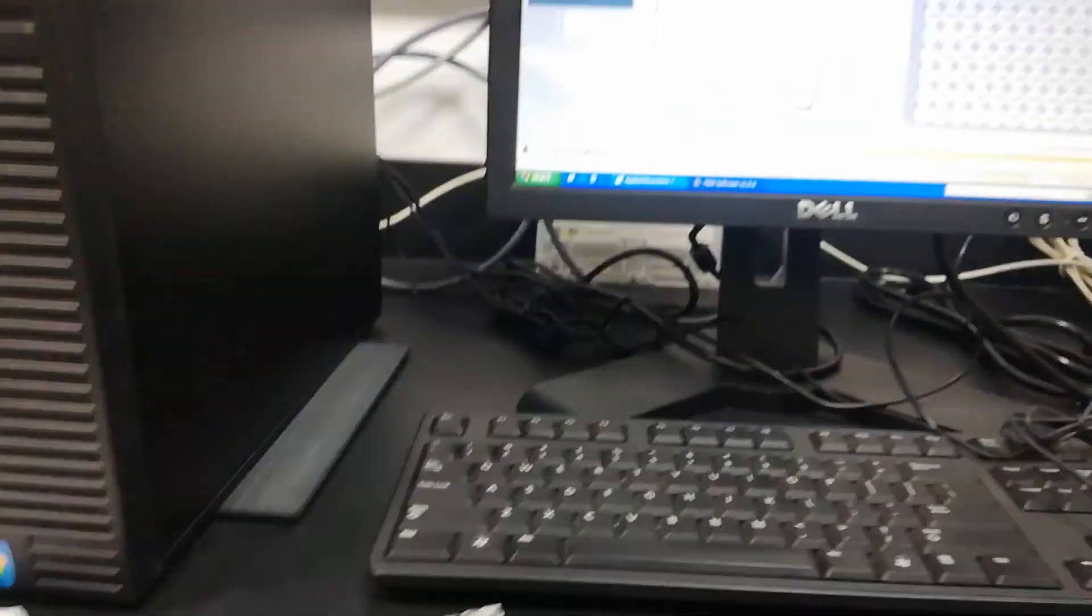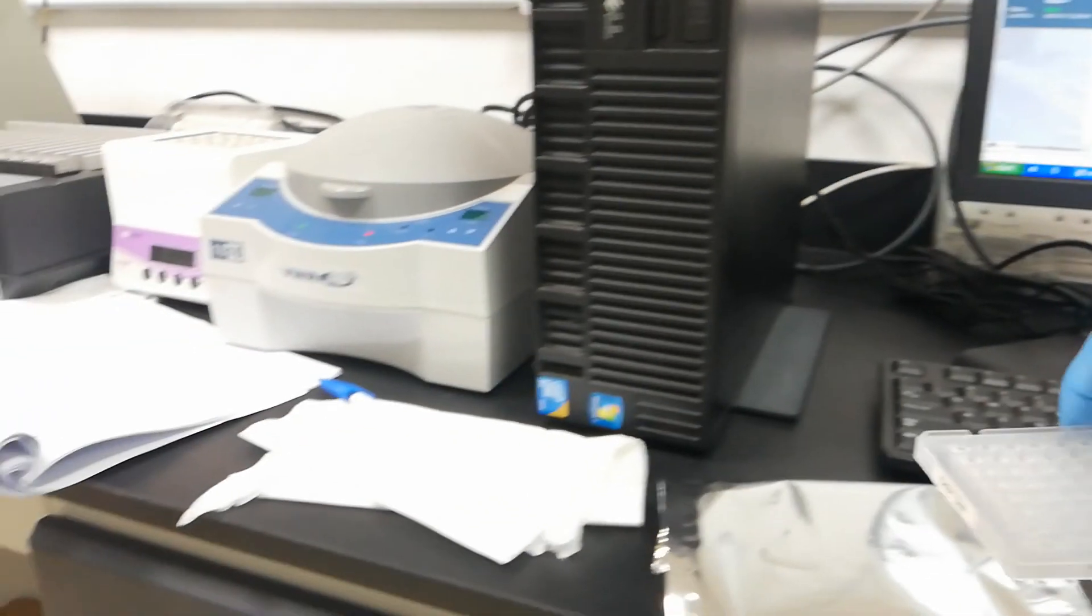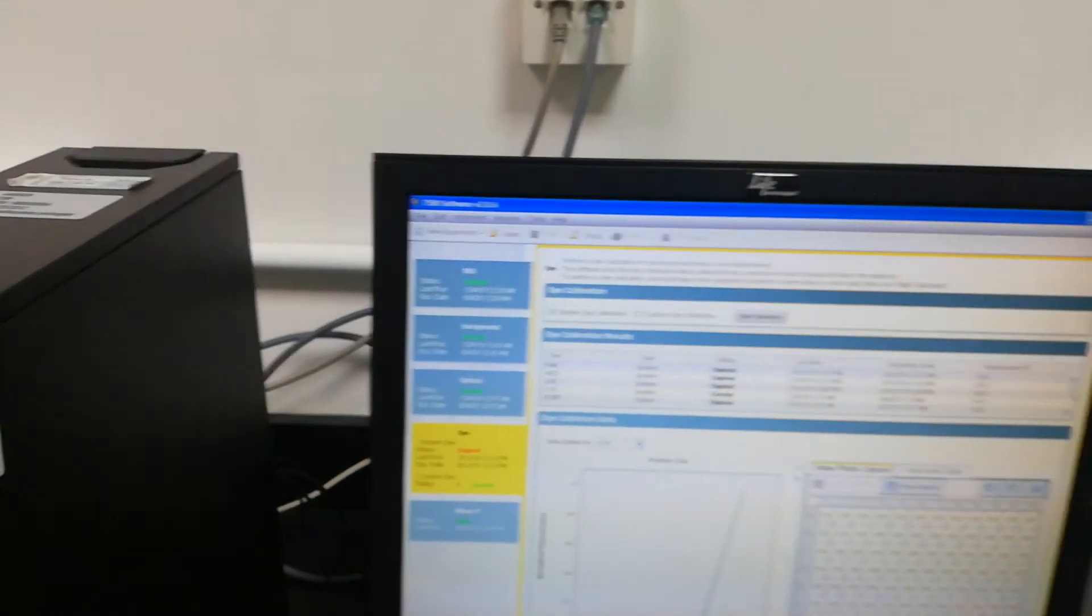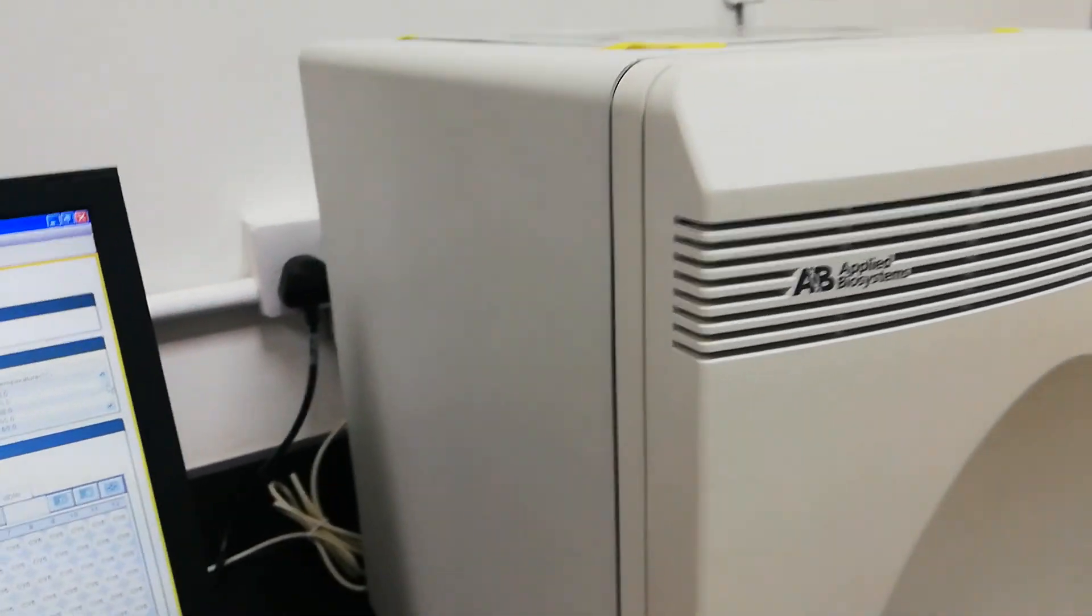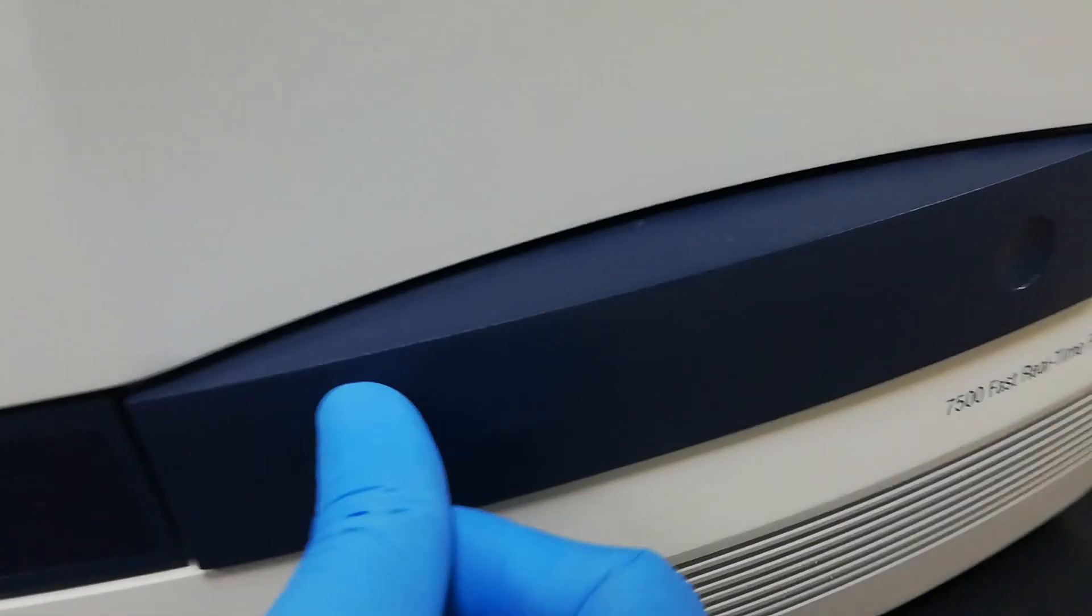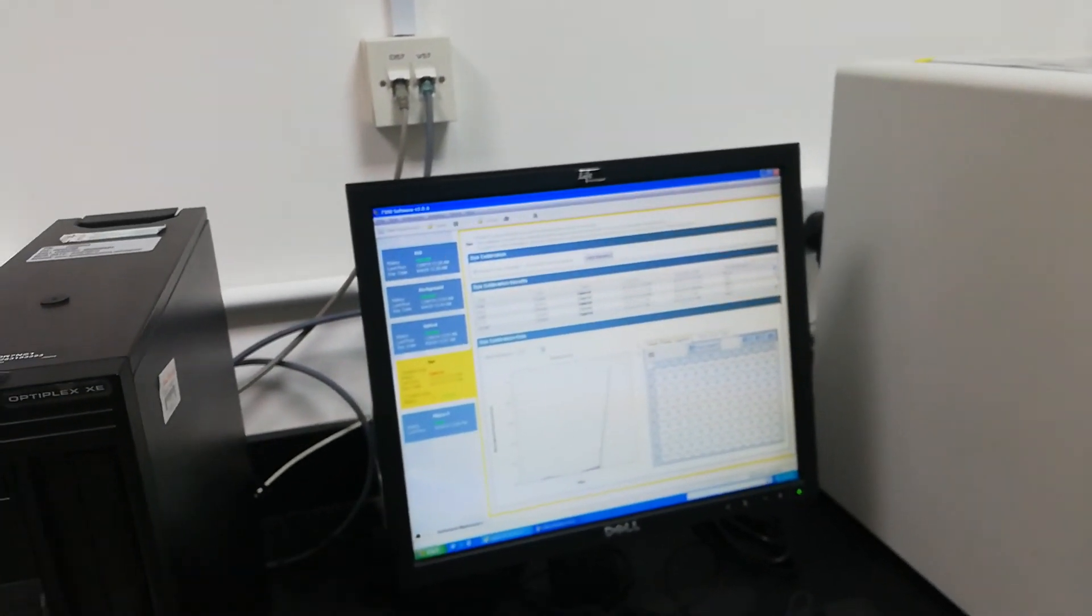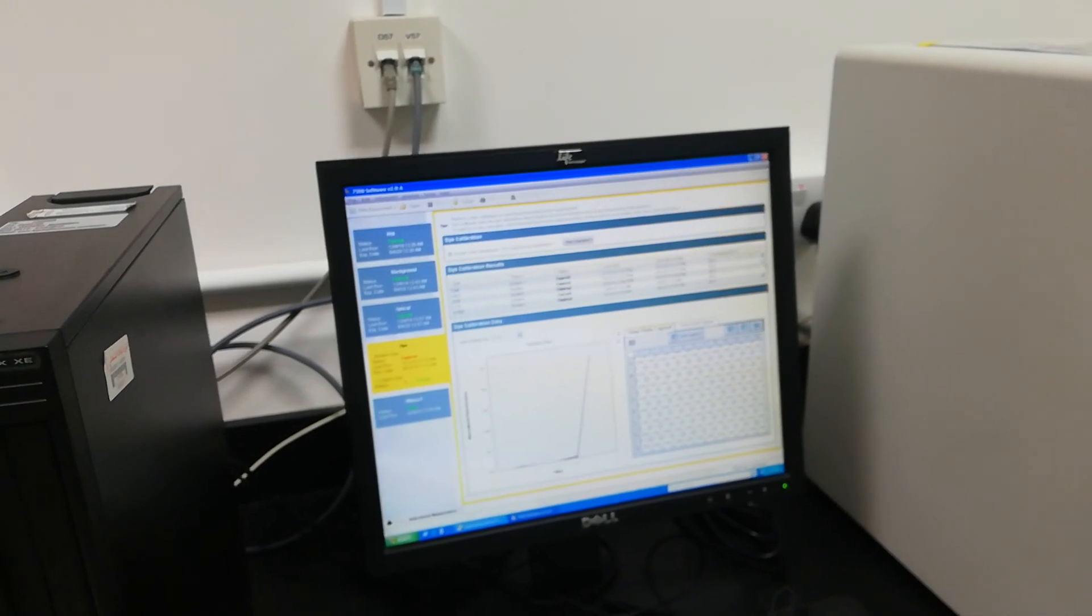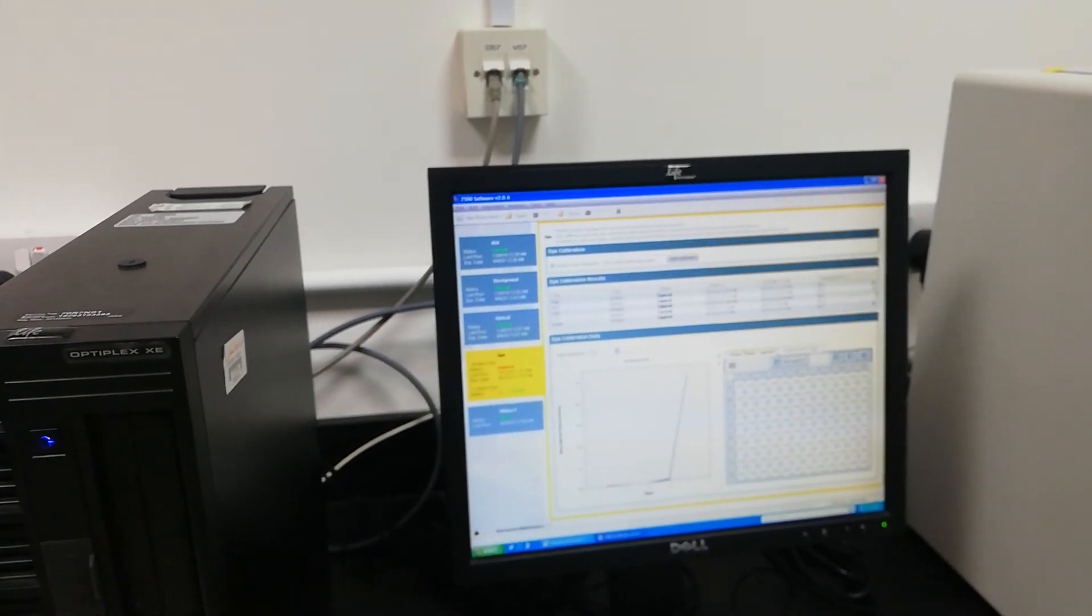Like this, all the dyes can be calibrated. This can be followed for all the dyes. This is all about the calibration of this ABI system. Keep following, you will find some new videos on different instruments. Just comment how do you find this video, is it helpful or informative, or some improvement is needed.